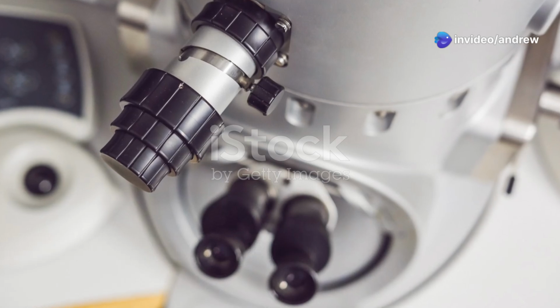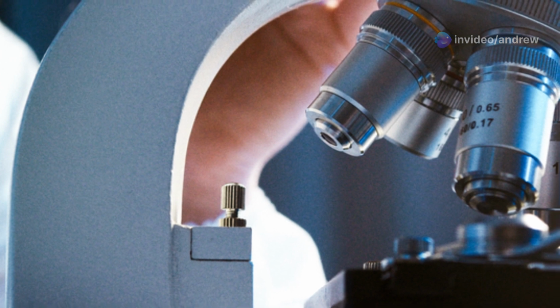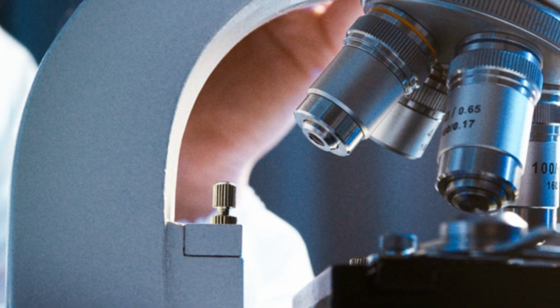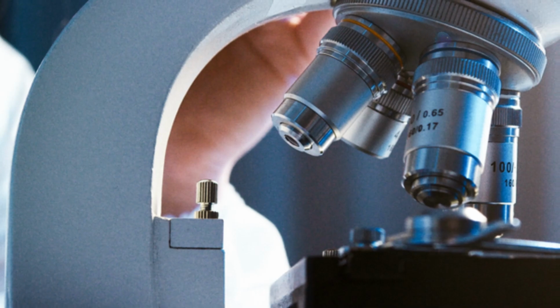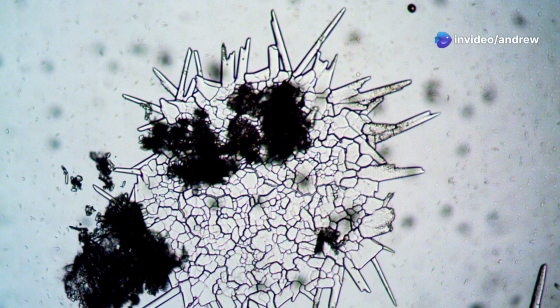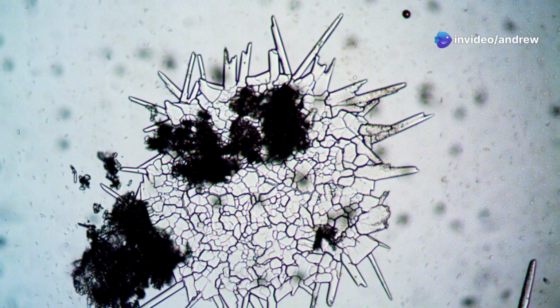Comparing the microscopic titans: TEM versus SEM versus REM. While TEM, SEM, and REM all employ electrons to investigate materials, they each offer unique capabilities and are suited for specific applications. Here's a comparison. TEM strengths: high-resolution imaging of internal structures, capable of atomic scale resolution.